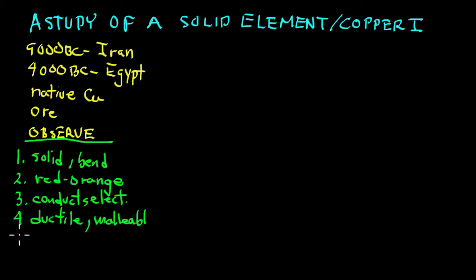And we can extend our observations with instruments. And we can calculate a mass. Remember, mass is the one that's called one of the base units.